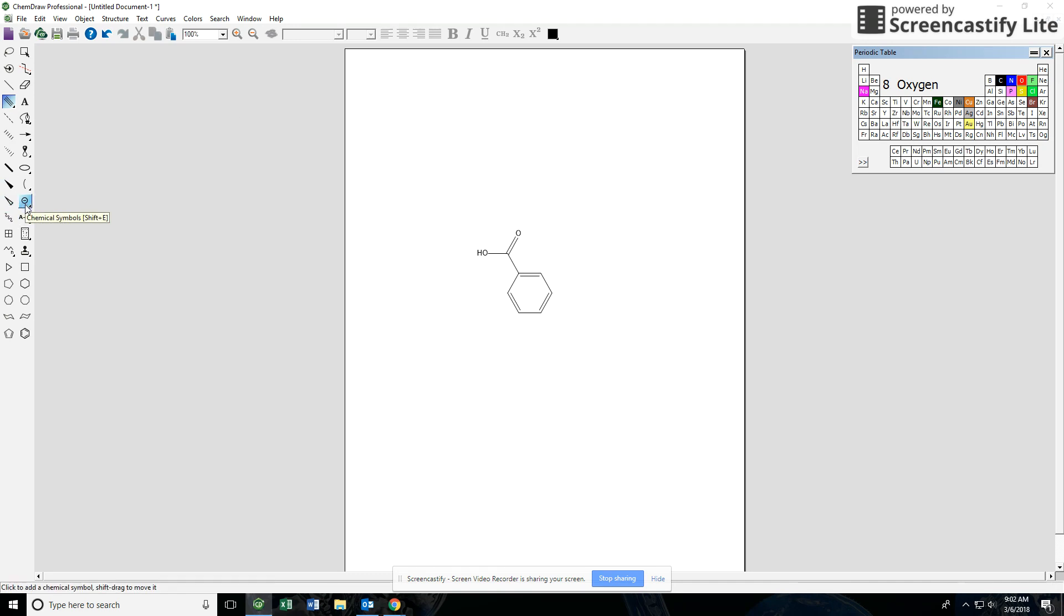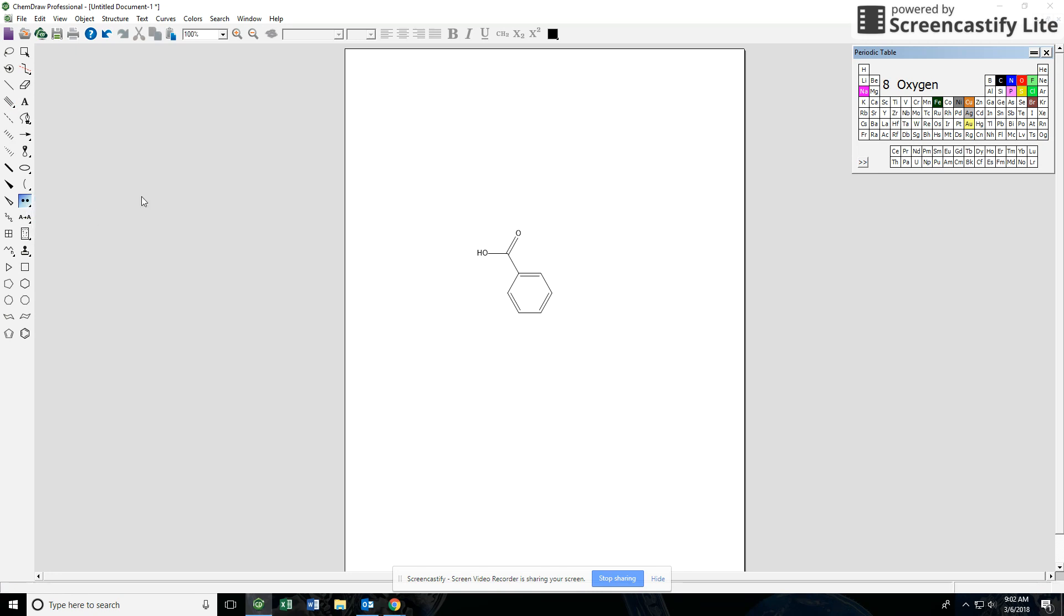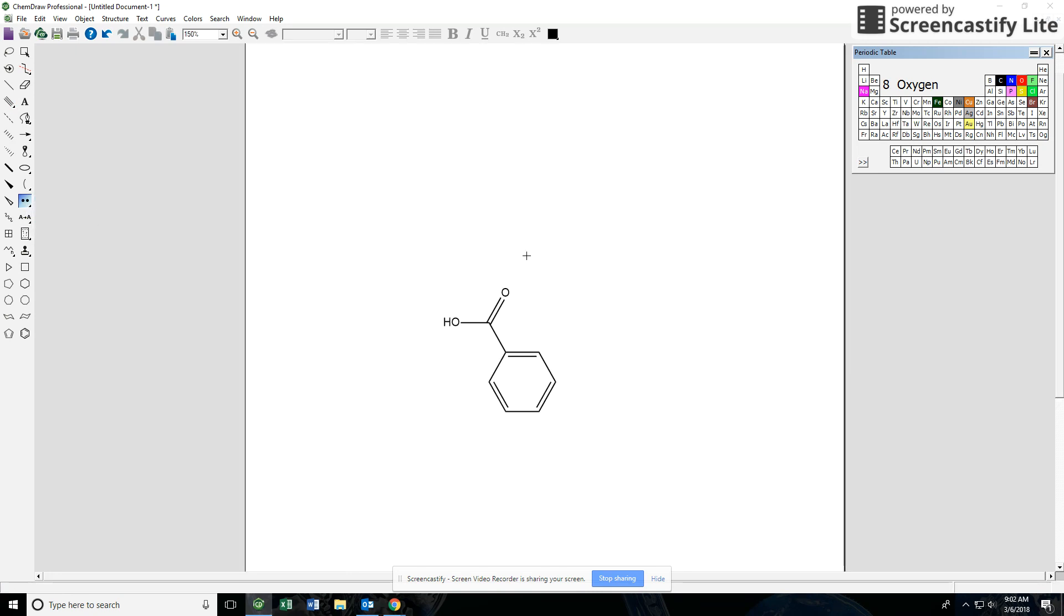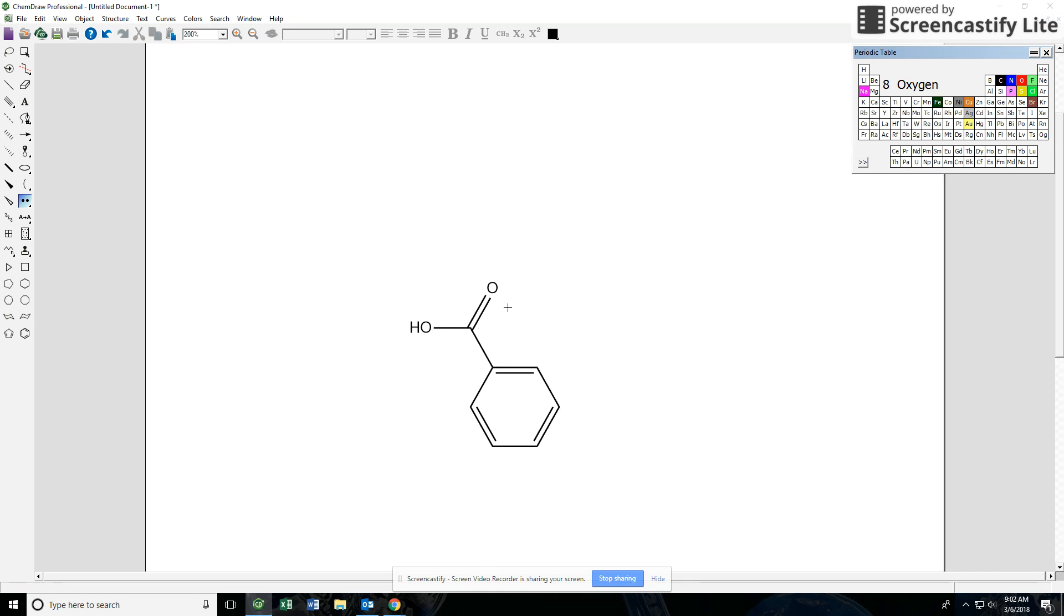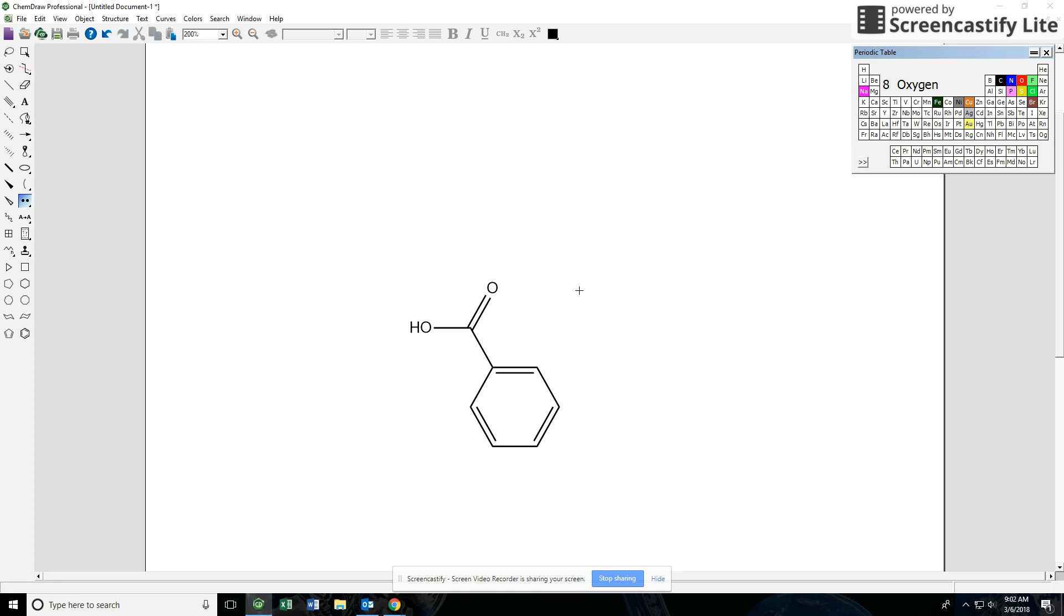Let's put some lone pairs in just to make it look nice and pretty. We go over here to our chemical symbols. There's our lone pairs. Let me zoom in. So I'm holding down control and using my mouse wheel. You can also go up here to your zoom also. If I just click on my oxygen it's going to add a lone pair there and add a lone pair there. If I click and hold I can move my lone pairs around to kind of position them where I want.